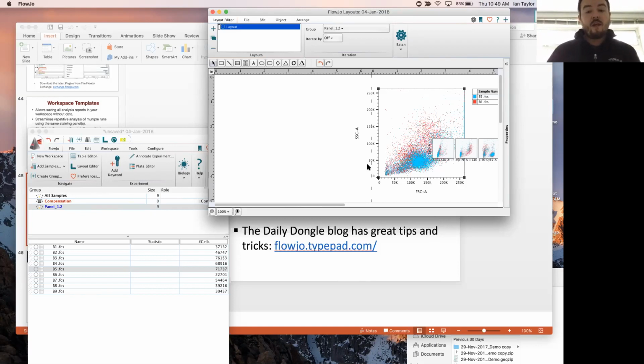Another question, if I'm looking for GFP positive expression, do I need compensation as well? Basically for just one channel. That's a great question. If you're only detecting one channel, then you can't actually perform compensation in FlowJo. So if all that you have is GFP as a fluorescent parameter, then I don't think you need to worry about it. Once you start to have multicolor experiments, then you'll certainly need to compensate. The good news is maybe if you have only 2 parameters, your compensation can theoretically be perfect. But anything above that will be kind of an estimation, and the estimation will get sloppier as you add more parameters to the data set. But for only one fluorescent channel, I don't think you need to worry about compensation.